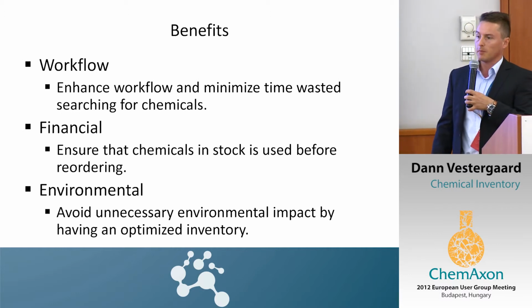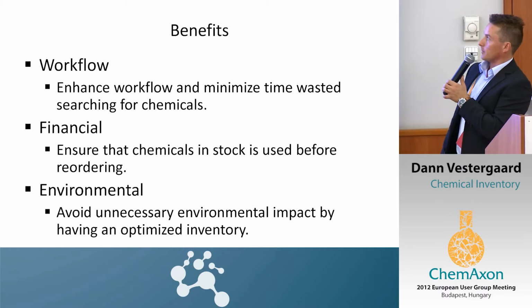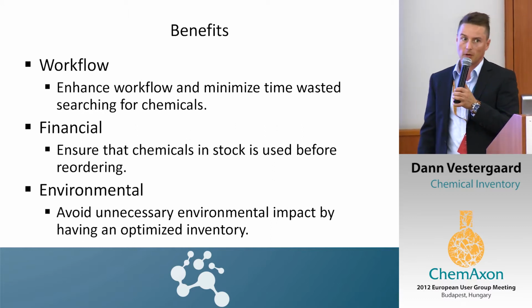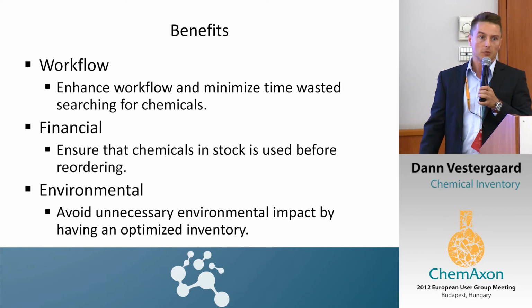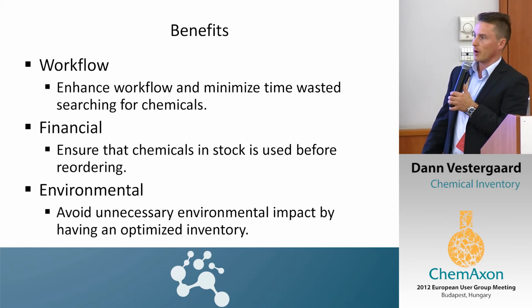Just a couple of words about benefits by using this application. Of course, you will have a tremendous enhancement in your workflow if you don't need to spend time roaming around the lab searching for the containers you actually need to work with.